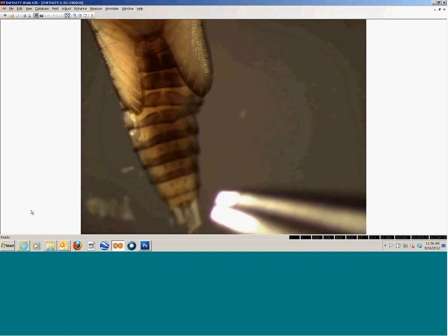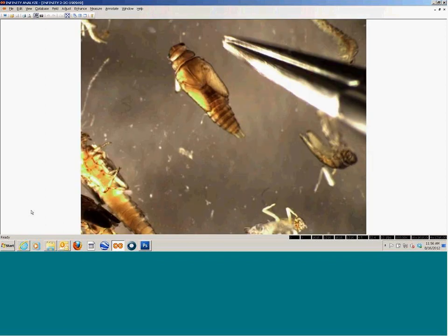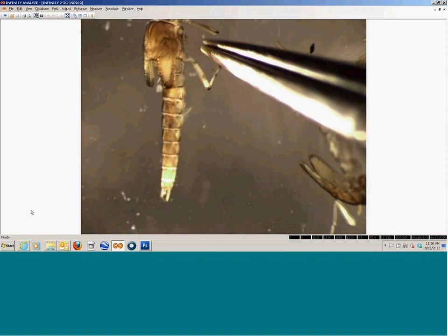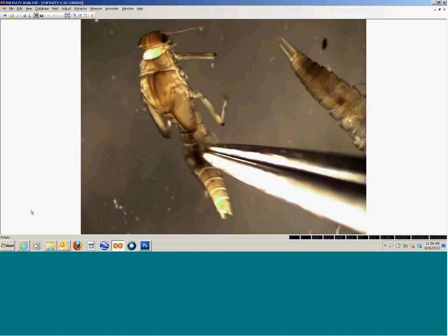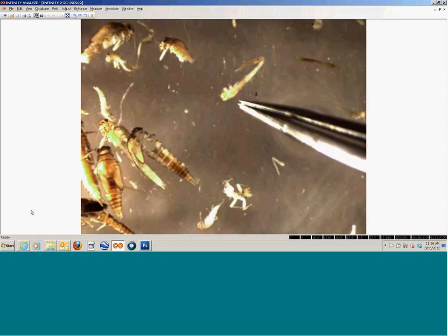In the past, you can see the color patterning here. In the past, I would have called that adonis right off the bat, but you can't anymore. Again, there's other mature larvae.